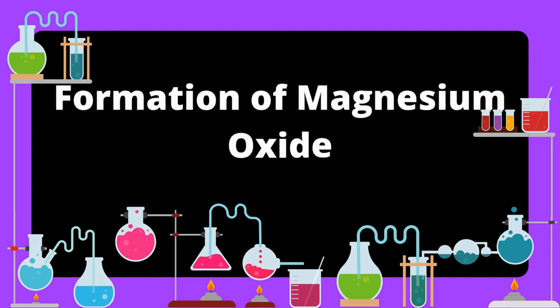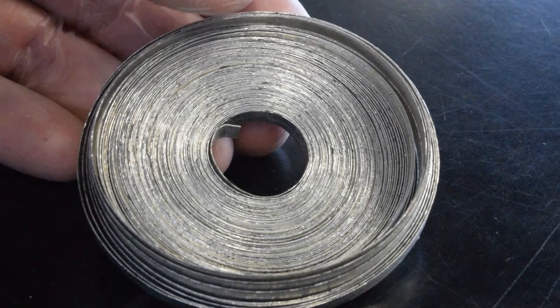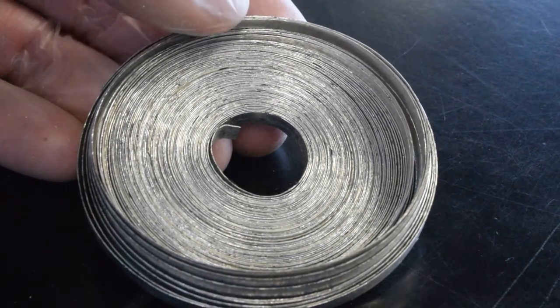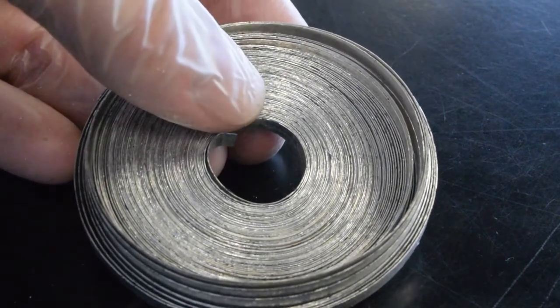In this experiment we're going to take a look at the formation of magnesium oxide. Magnesium is an alkaline earth metal found in group 2 and it's a solid at room temperature typically packaged as a ribbon.